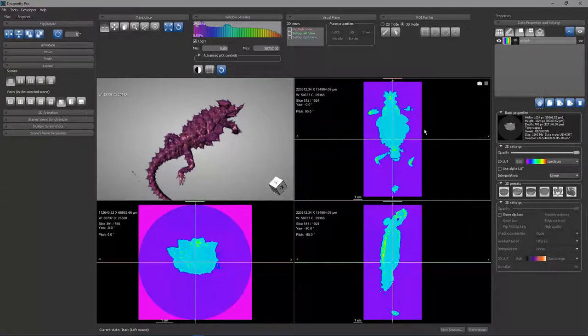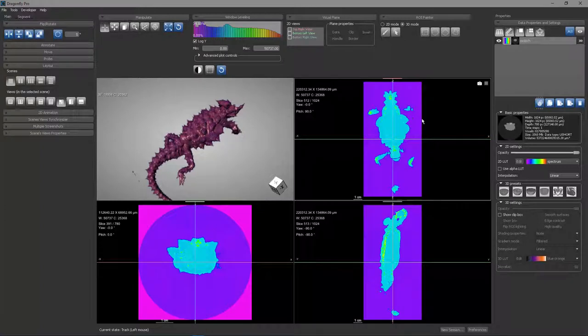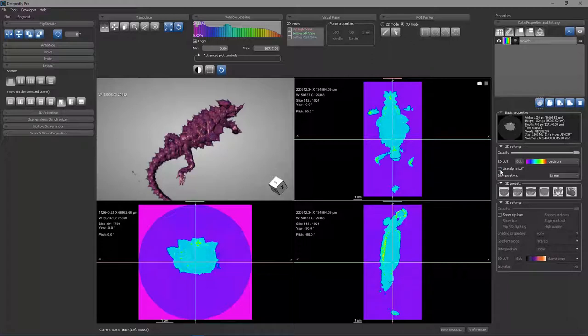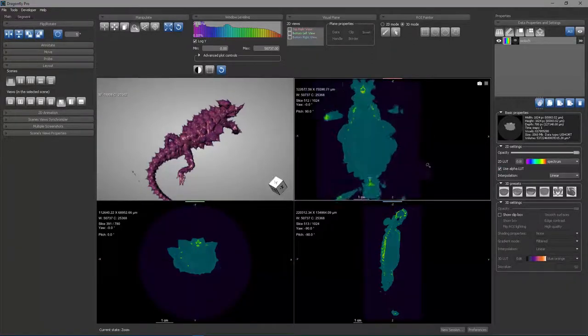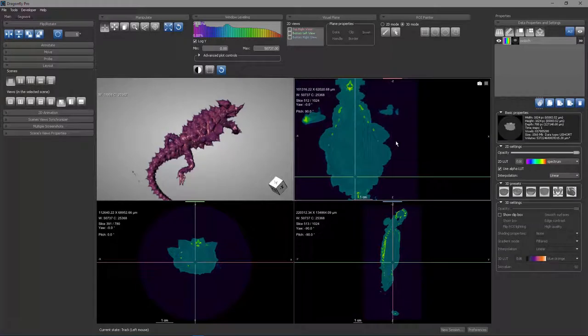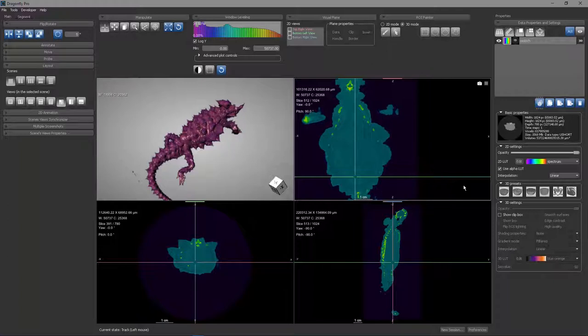In the 2D window, the alpha intensities are ignored unless you tell Dragonfly to attend to them. This use alpha LUT tells Dragonfly to use the alpha intensities. And so now you can see that all those low values are actually now being rendered mostly transparent. So that behavior is off until you click that checkbox.